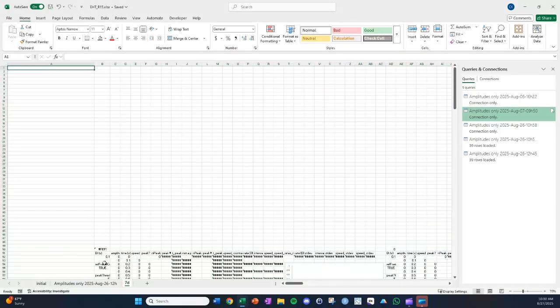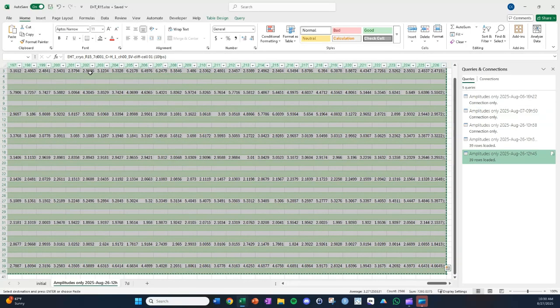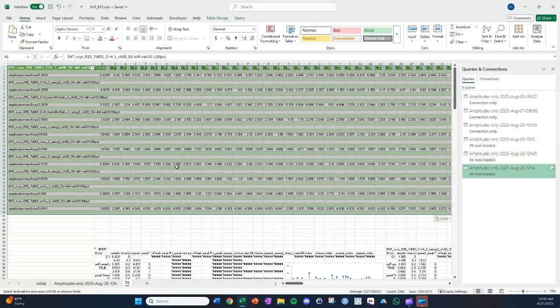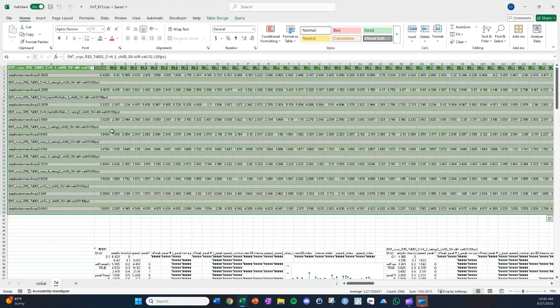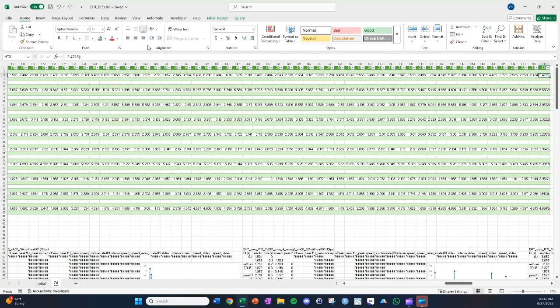So same thing here. I'm going to paste in the new data. Correct the name again. Delete the ending again.